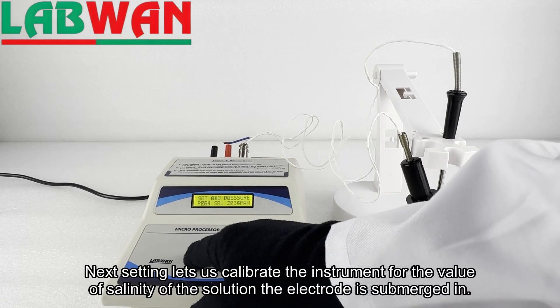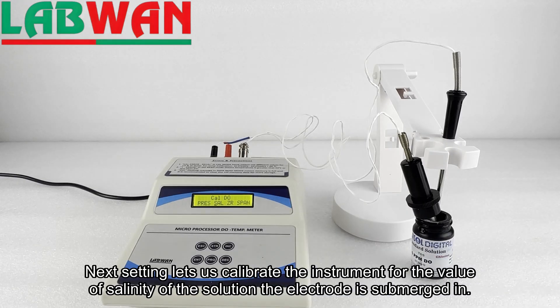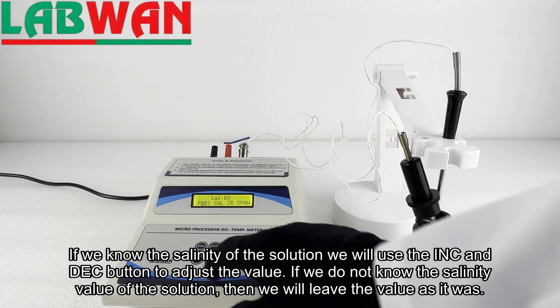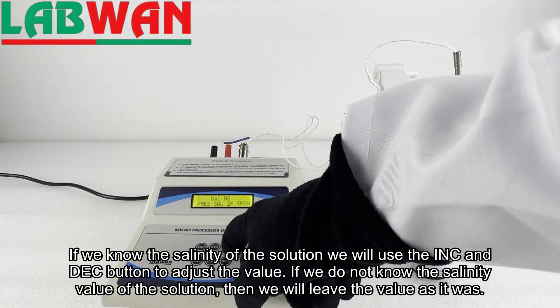The next setting lets us calibrate the instrument for the salinity value of the solution the electrode is submerged in. If we know the salinity of the solution we will use the INC and DEC buttons to adjust the value. If we do not know the salinity value of the solution, then we will leave the value as it was.